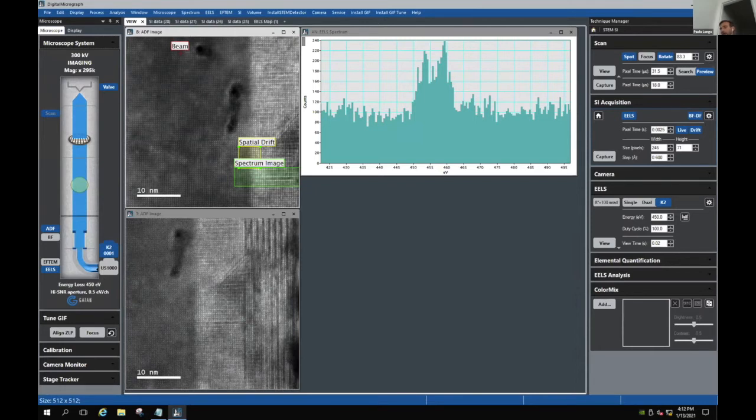But in the case of a CCD, you actually read out one pixel at a time. So that's why binning is very important for a CCD. Now, the faster you go, that in the case of a CCD would definitely affect the duty cycle, because you still have to move the charge pixel by pixel. So this is why the duty cycle of a CCD gets worse and worse as you go faster and faster. The faster you go, the worse your duty cycle is.